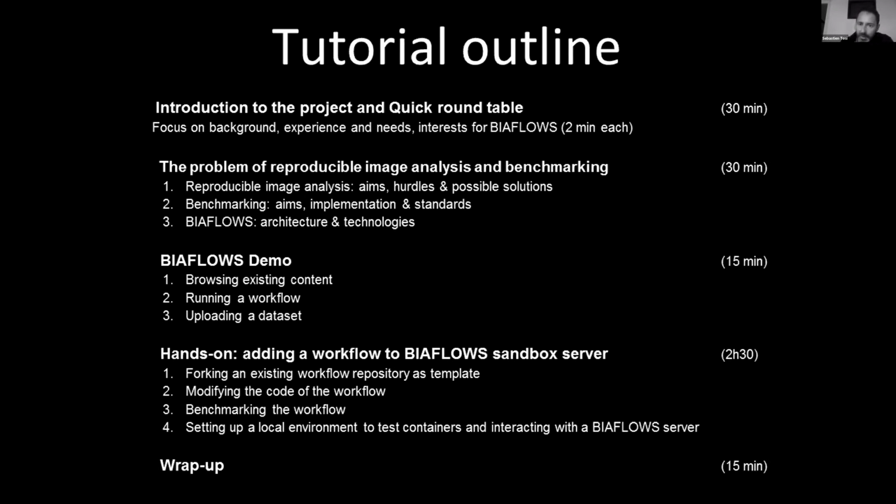Well, depending on how many we are at that point, it can be a bit longer, but let's keep it short. Then we will have some technical introduction on the challenges when doing reproducible bioimage analysis, or image analysis actually as a whole, and benchmarking, and also the technological solutions we've been choosing while building the platform to address these challenges. And then Raphaël will perform a demo of BIAflows.